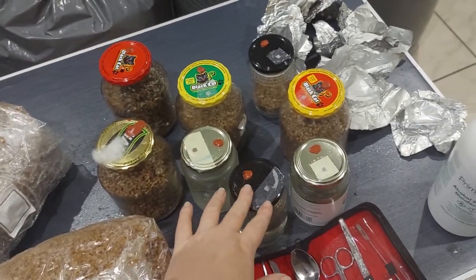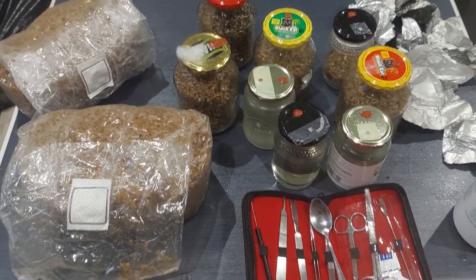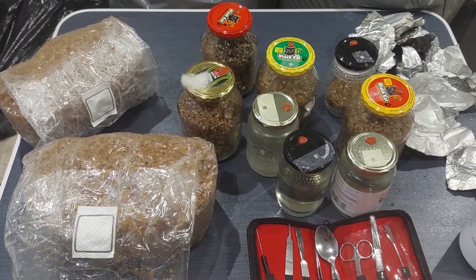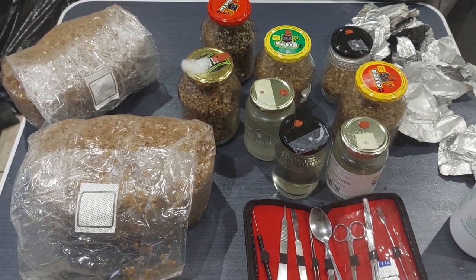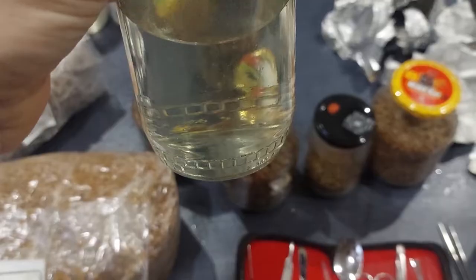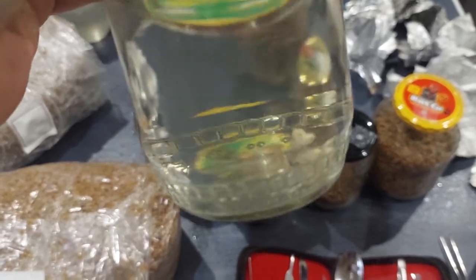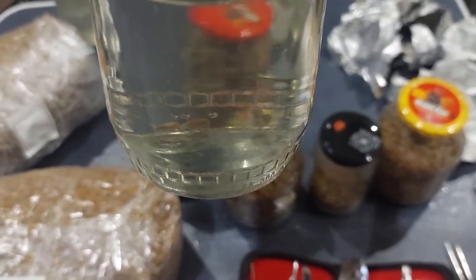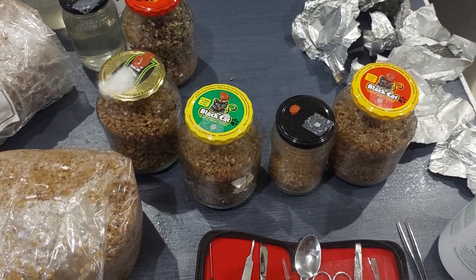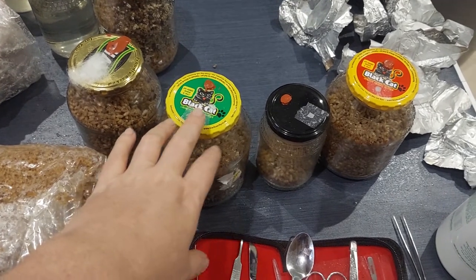Our honey jars are almost ready to go — these will be the first ones because we don't want any issues with contamination. I've added a few grains of the mycelium grain spawn into the honey jar and those are all done.